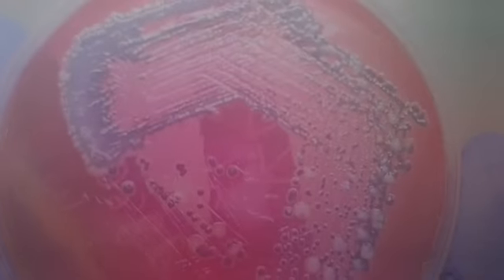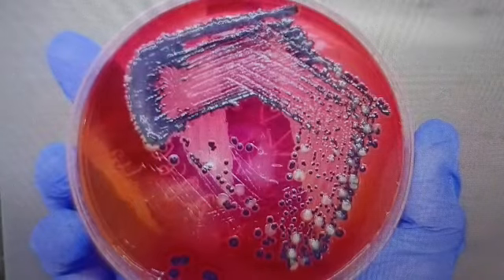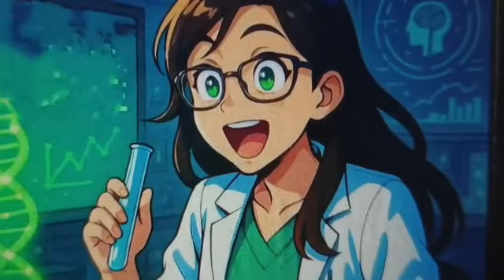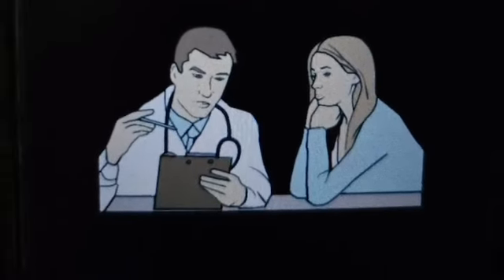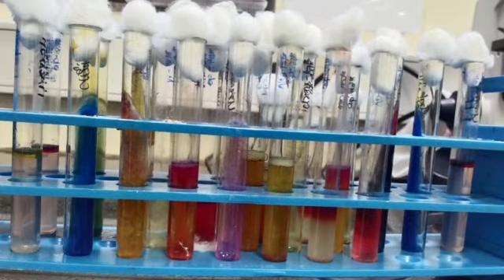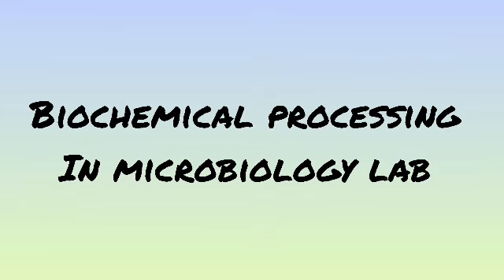Different bacteria, different reactions, and that's where the magic begins. Ever wondered how microbiologists identify invisible organisms with such confidence? Not by guessing, but by making bacteria talk through biochemical reactions. In today's video, we will walk through the step-by-step biochemical processing used in microbiology labs.